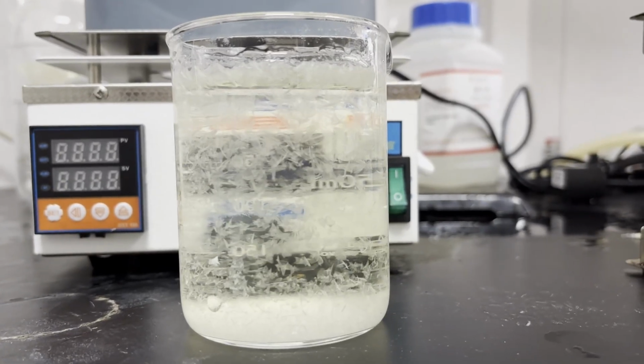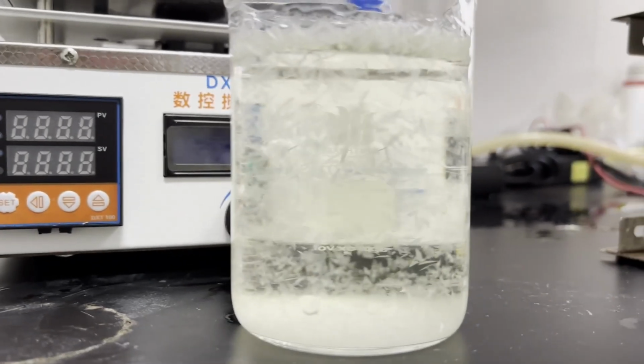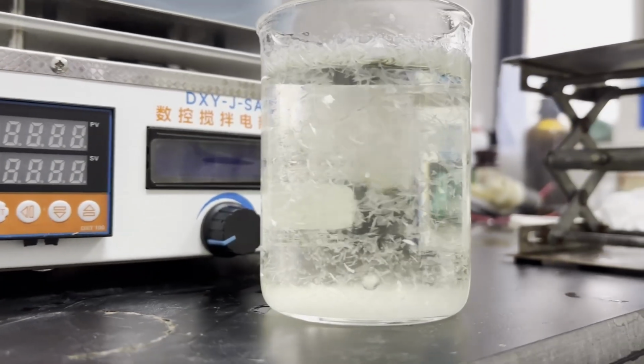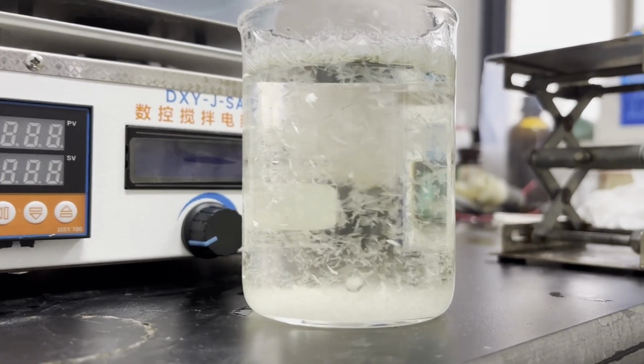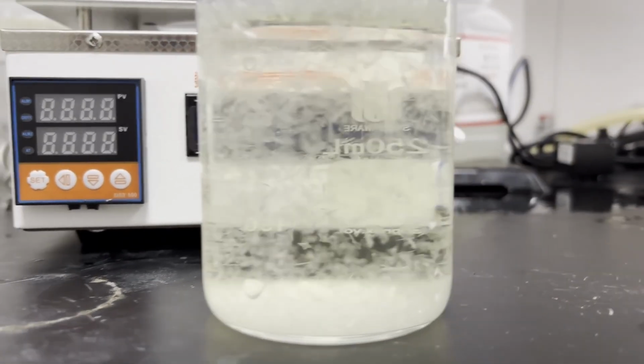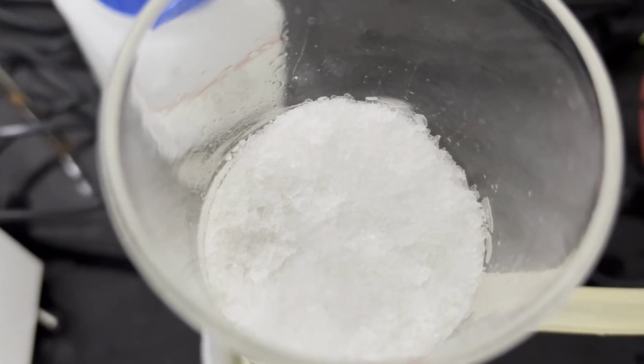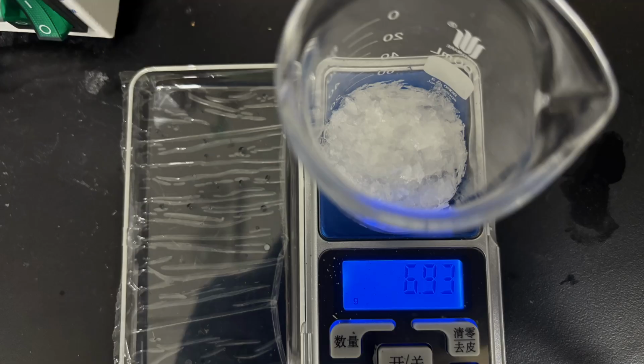I decanted the supernatant to another beaker to see how much azide dissolved in the solution. As the solution cooled, gorgeous flaky crystals of potassium azide slowly separate. To be honest, these crystals are probably one of the most beautiful ones I've ever seen. After cooling to room temperature, the crystals are filtered off and weighed to be 6.93 grams.